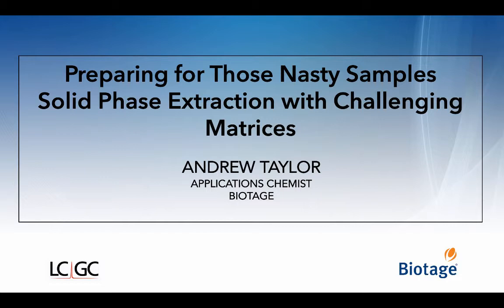Can you use glass wool as a pre-filter? Yeah, glass wool is actually an incredibly useful pre-filter when you're dealing with particulate-laden samples. When you're assembling a disc holder for those really dirty samples, you want to start with a 1 micron pre-filter and then stack a 5 micron pre-filter on top. And then glass wool can be placed on top of the pre-filters themselves. When you use the glass wool, it's good practice to pull apart the glass wool in order to ensure that the fibers are going in all different directions, and this allows for the filtration to be more effective.